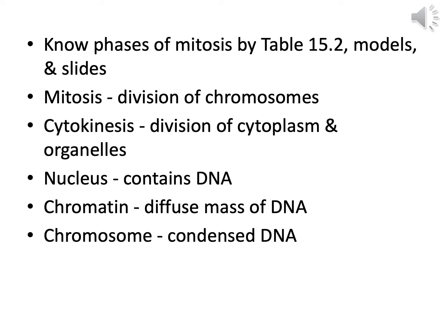You will need to know the phases of mitosis listed in table 15.2 on page 155. We've also got some pictures of some models, and while we'd normally have some slides, you might want to take a look at some slides in the science tutorial lab. We've at least got pictures of slides today.